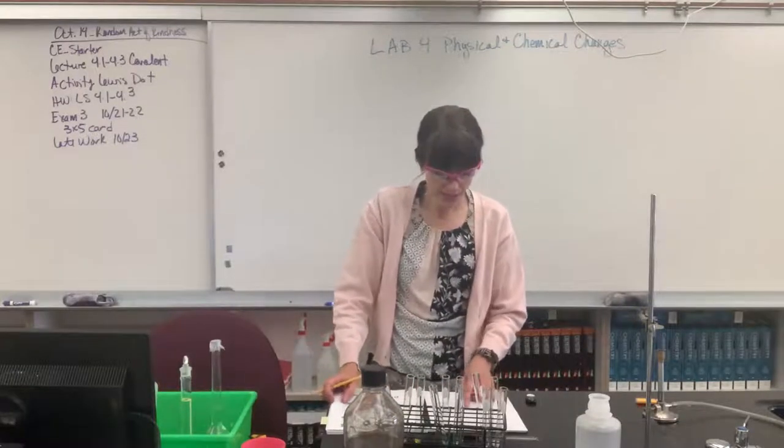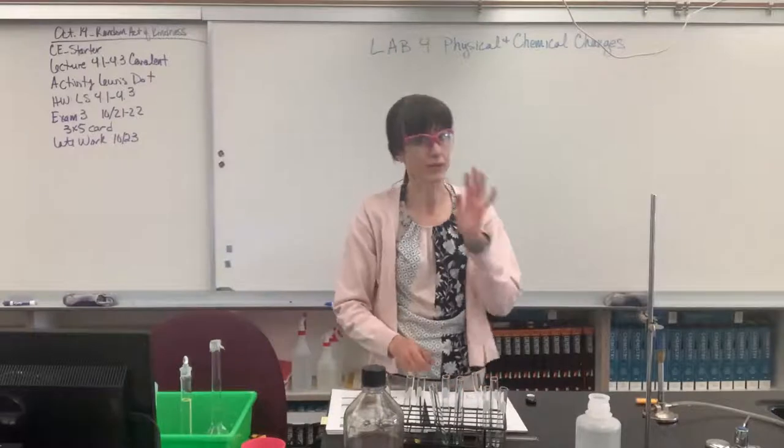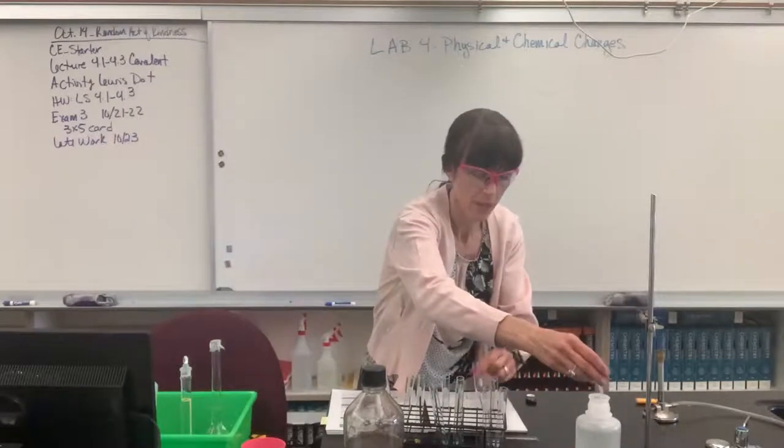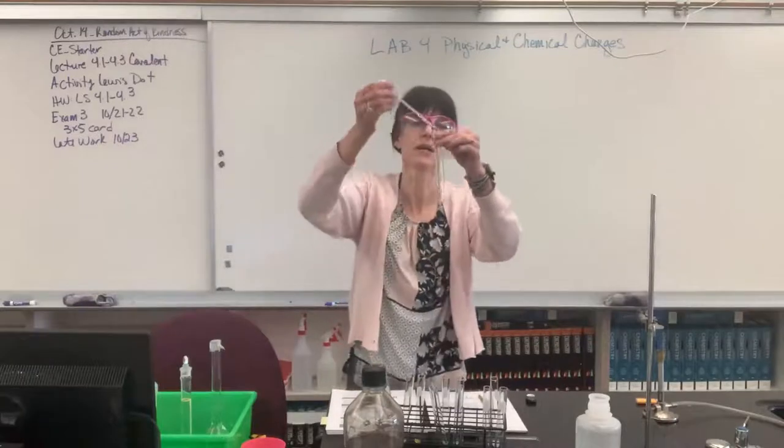It says dissolve the second sample of sodium chloride in water by adding 20 drops. Okay, let's do it. I'll get my distilled water again. Here's my second sample of sodium chloride. Here we go.